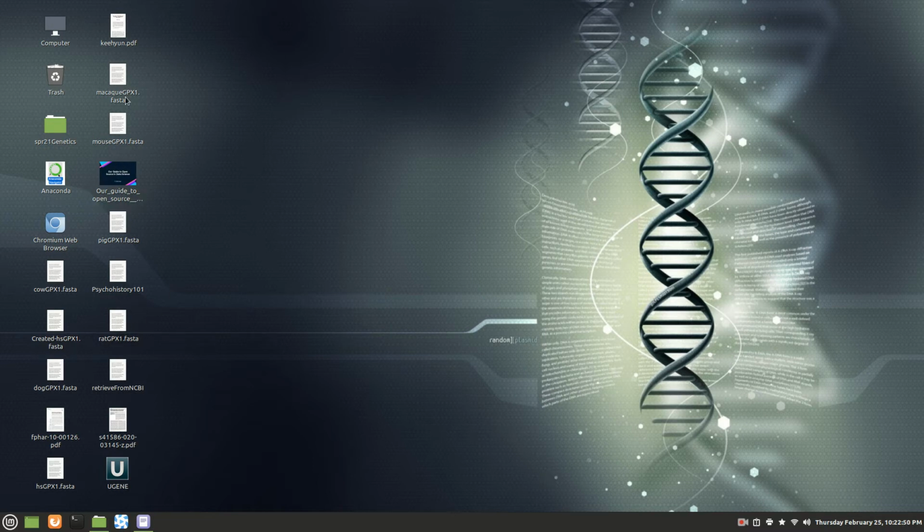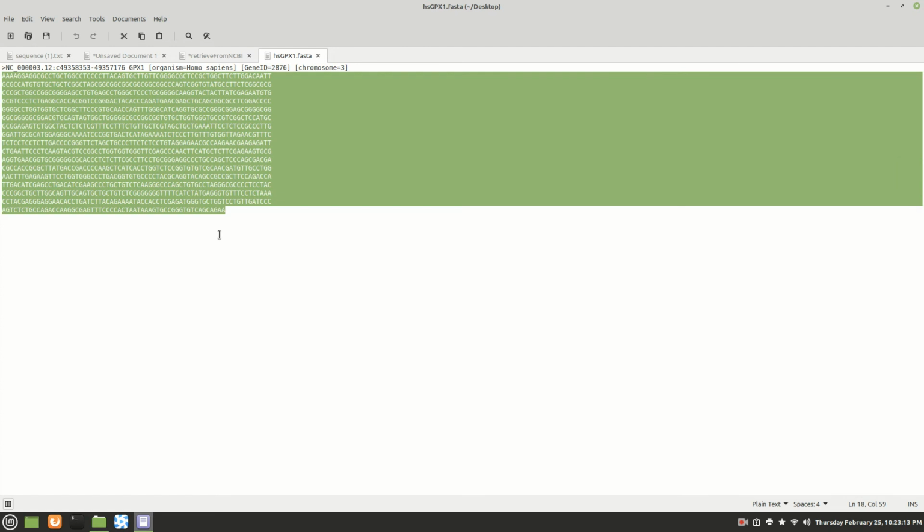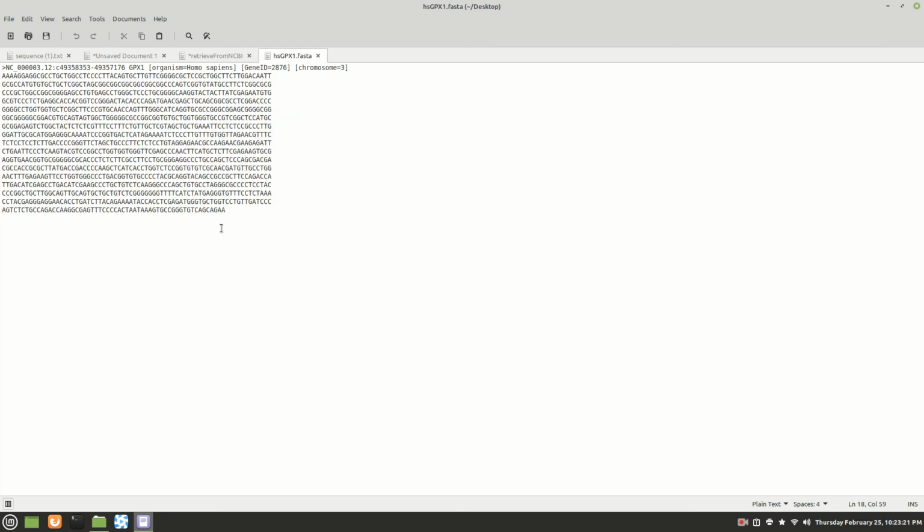Now what does a FASTA look like? Looks like this one. This is human. All right, and this is the old one. You need to get the updated one that we just looked at, so this would be old. And so the first line of a FASTA has your information about it. All right, and then you just put the letters here, so when you download it, we'll download the letters, and it should put something up here. If not this, it should put something similar up here at the beginning, and that should be what you download. All right, I hope that helps.